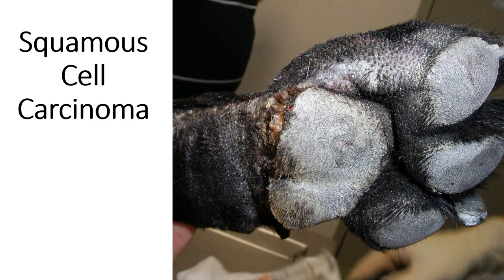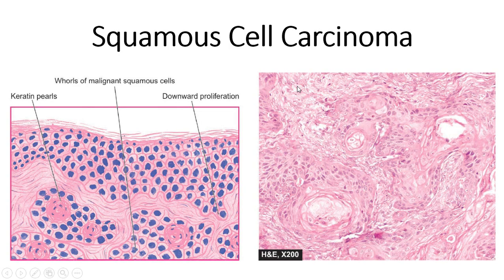Okay. So if it's in cases of the malignant type of epithelial tumor in skin, in the squamous epithelia, for example, we call it squamous cell carcinoma. Here, this is the foot pad of a dog with slight enlargement here. So the slight enlargement is actually a tumor.